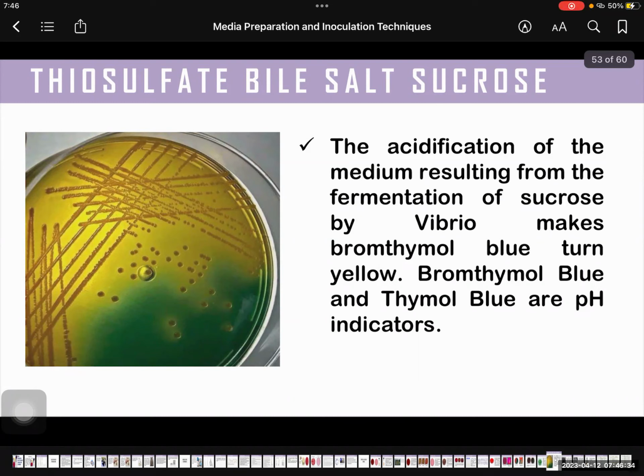So, an example of that, ano ba? I think Vibrio cholerae and Vibrio mimicus. Vibrio, kalimutan ko na. Pero sigurado ako kay Vibrio cholerae.